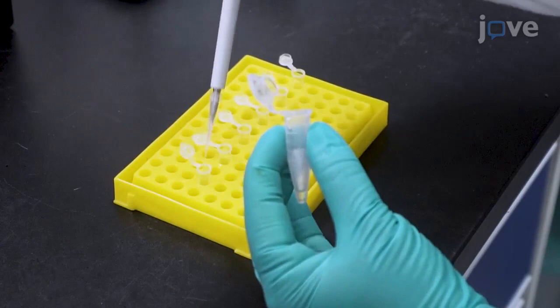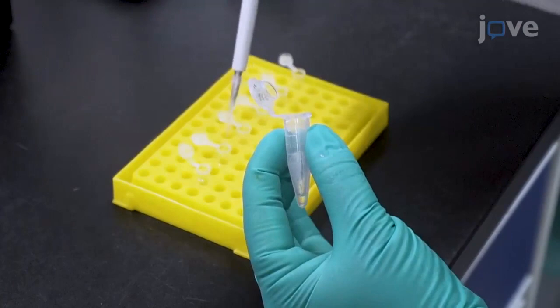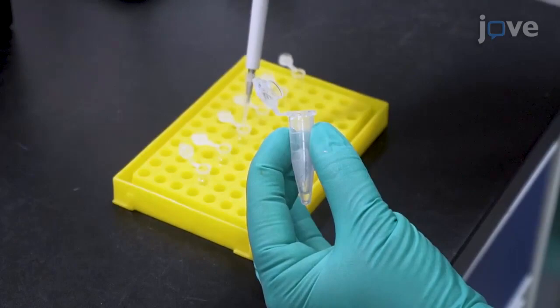First, use the DNA supernatant from one well as PCR template to optimize the annealing temperature. Add reagents and 1 microliter of DNA supernatant into each PCR well.